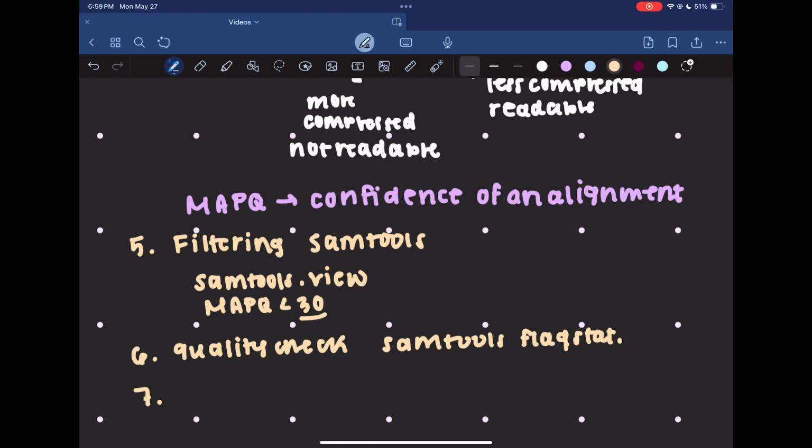And obviously, you want to see that there's a high-ish proportion of reads that were successfully mapped. That indicates that your RNA-seq data was of a high quality and was being successfully mapped to the reference genome. For my data, I was sitting at 85 plus, which I've seen is a good quality to be sitting at.